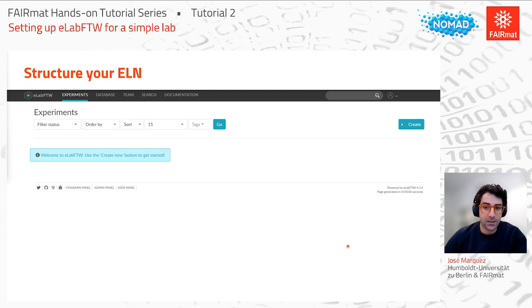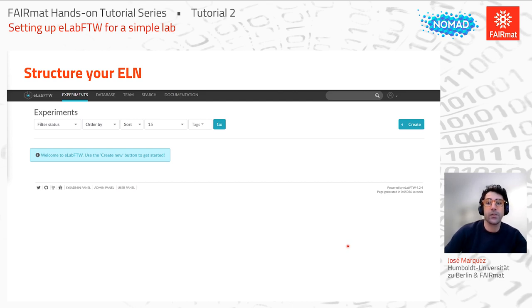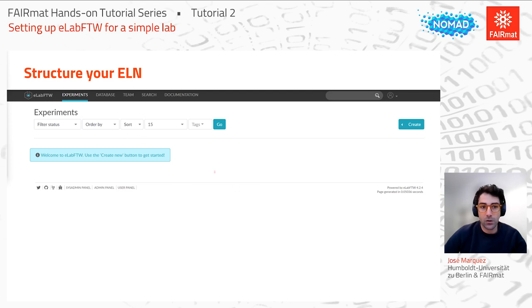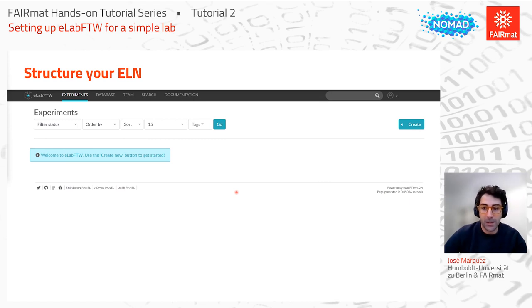You can install it yourself on a local server in your lab, or the installation may be provided by the IT department of your university or research institute. At your starting point you'll be part of a team with an empty ELN. In the main page — as Christoph also showed yesterday — we have five tabs. The first is the Experiments tab, where the list of experiments you register will be displayed. You can create experiments by clicking the Create button, and clicking the arrow lets you select predefined templates.